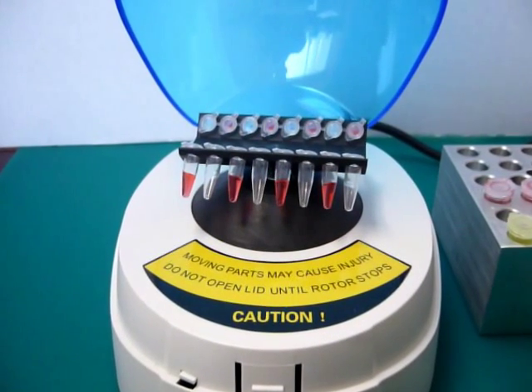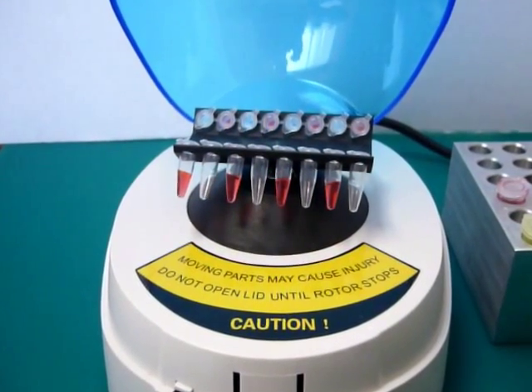After a 5 to 10 second run, the lid can be opened and your samples can be removed.